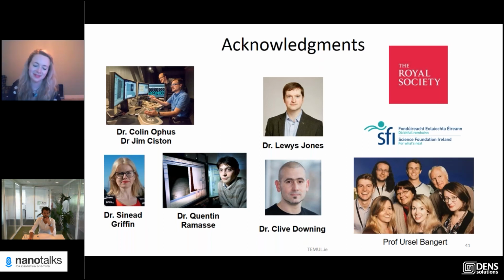So you mentioned, Wesley, one of your samples is a FIB lamella, and I'm just curious if you encountered any issues making a working device using a FIB lamella, and if there are any tips and tricks to achieve that.